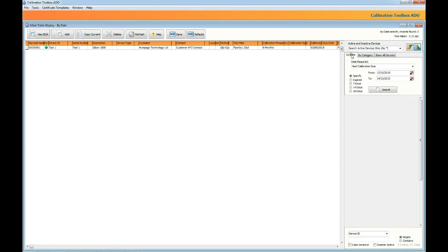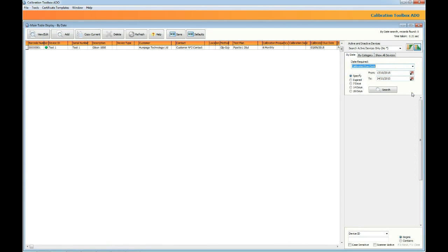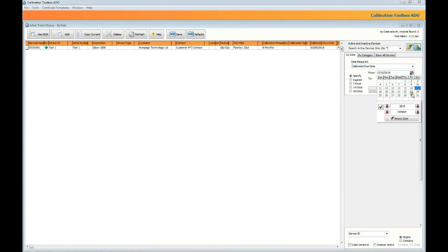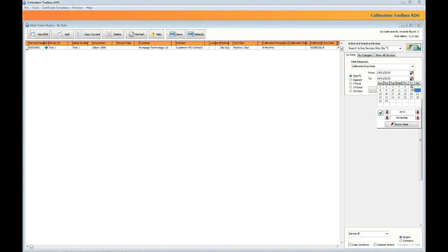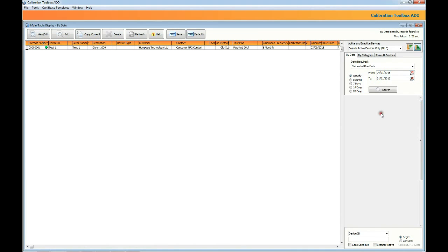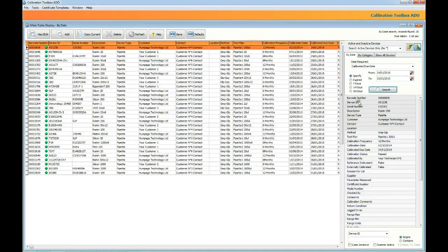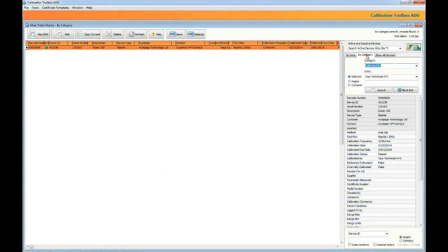Now you might not want to see all of the devices in the database. For example you might want to see devices whose calibrations fall due on a particular set of dates. We're doing that by clicking the by date tab. We've chosen the next calibration option and what we're going to do is find all of the devices who require calibrating in the last week of January 2015. We're setting our from and to dates using the date selectors. You can also specify 30, 60 or 90 days as a preset option but in this case we are using the specify option. We've clicked the search button and there are the number of devices who require calibration in the last week of January 2015.